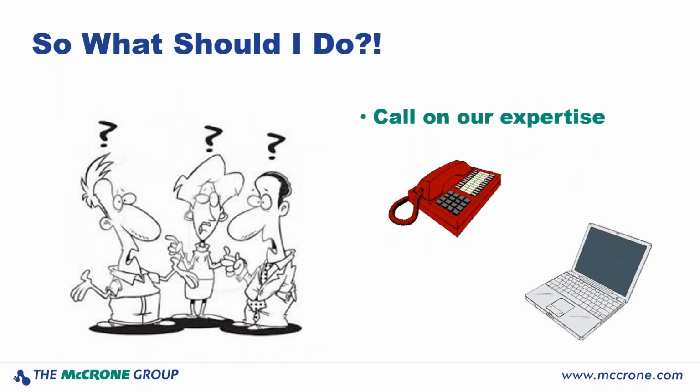So now that I've explained all of these challenges and taken away all of your very favorite sampling devices, how are you supposed to approach this problem? Well, there are ways around everything, and sometimes, usually, knowing what has happened to a sample before we see it or before it gets to whichever laboratory you're using is the best defense. So call us. Call on our expertise for how best to sample or how best to package. Email us and let us know this is what we had to do. We didn't have any other options for how we were going to sample this.